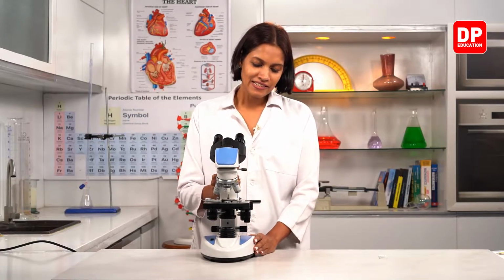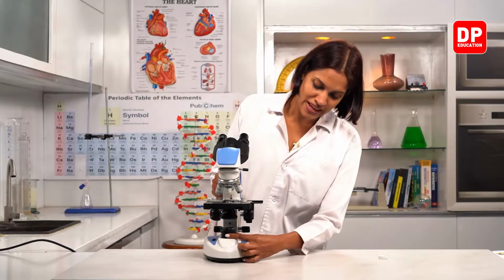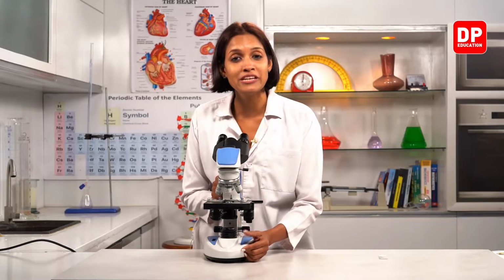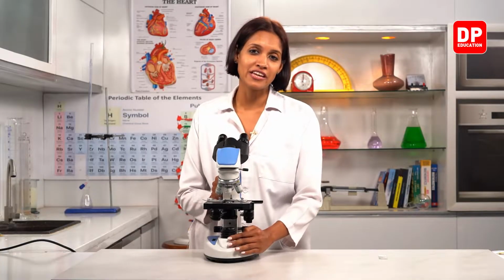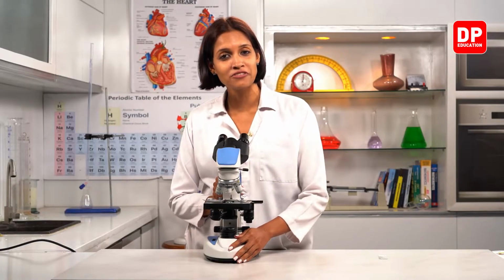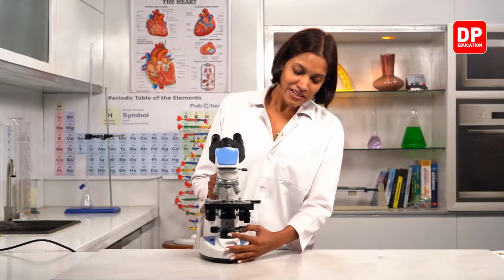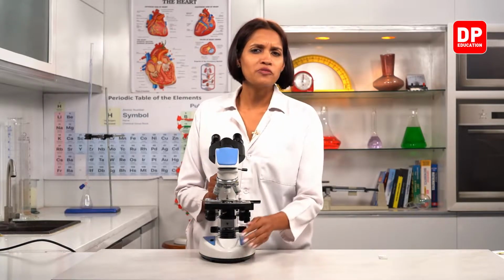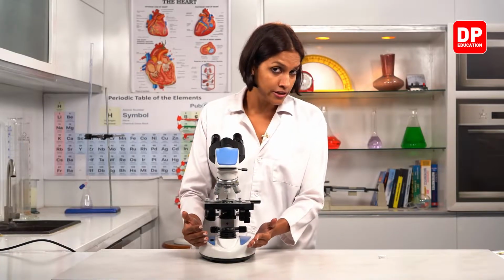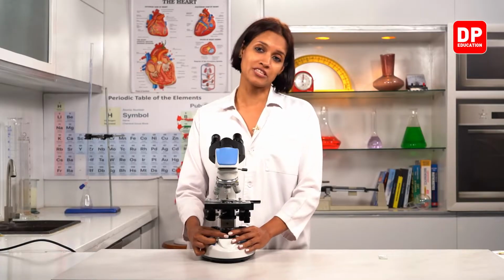Right, children? Now in the basic microscope, remember this place, instead of the light bulb, what is present, children? There's a mirror. That mirror can be rotated. One side of the mirror is a plane mirror, the other side of the mirror is a concave mirror. Right, children? That mirror can be rotated. What is the importance of that mirror, children? Now this developed microscope has a light source fixed to the microscope itself.